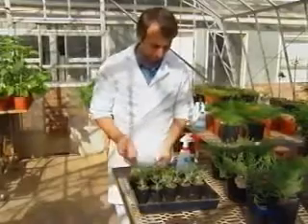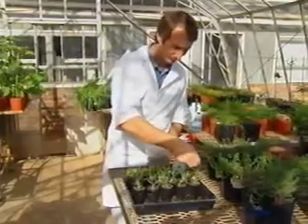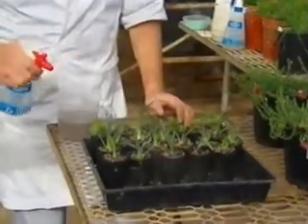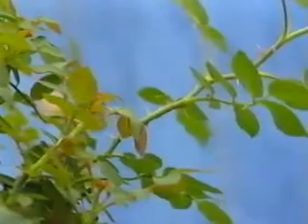By establishing the stock plants in a glasshouse, we can ensure that the plants have been fertilized properly, have been sprayed with pesticides and fungicides, and have been pruned so that new, young, vigorous growing shoots are established.